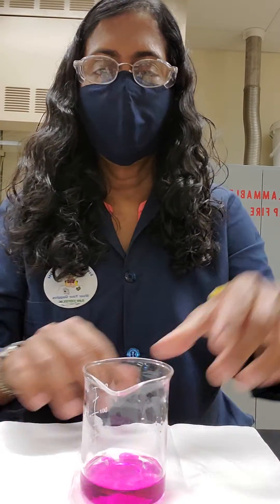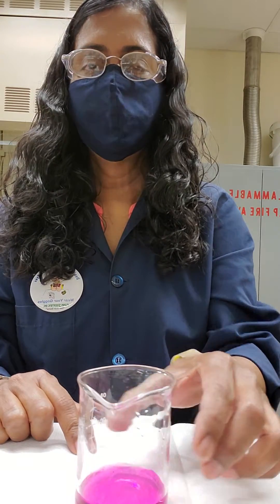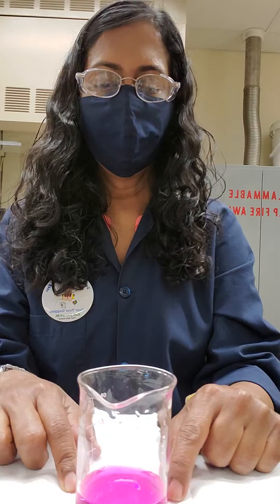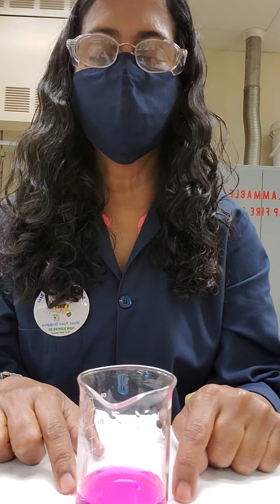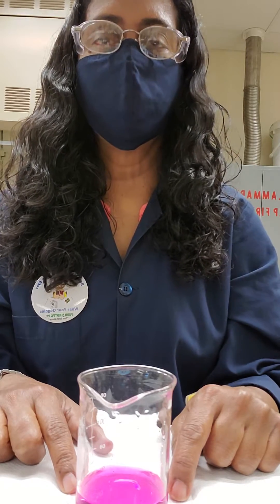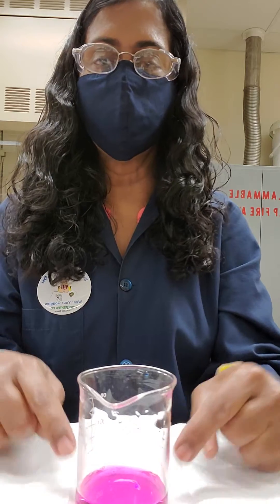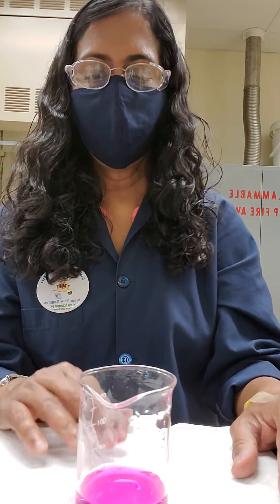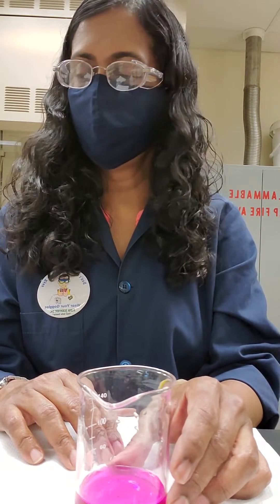Wow! That is a really nice bright color. This indicates the color of phenolphthalein in basic solution. If you remember your acid-base titration from Chem 140, this is the color of the endpoint — not this dark, but somewhere close to this shade. That's the color of ammonium hydroxide with phenolphthalein.